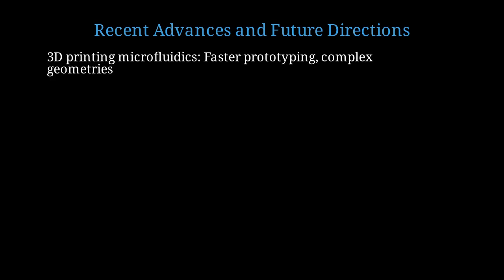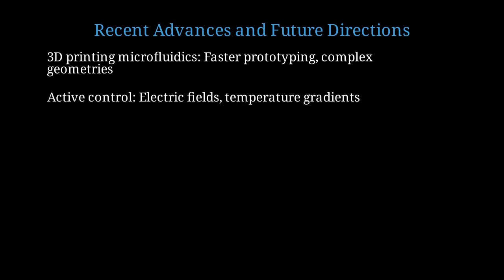The field is rapidly advancing. Let me highlight some exciting recent developments and future possibilities. Three-dimensional printing of microfluidic devices is democratizing the technology. Researchers can now rapidly prototype complex channel geometries that were previously impossible. Active control using electric fields, magnetic fields, or temperature gradients allows real-time tuning of droplet formation and particle properties.